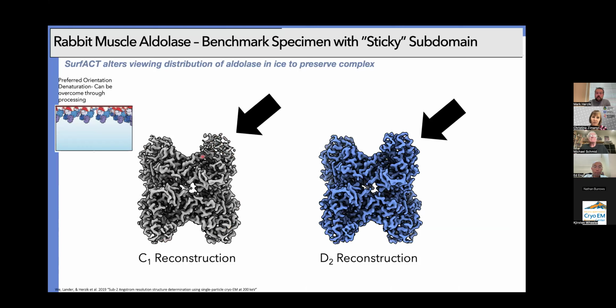But if you start completely asymmetric, with no symmetry imposed, they all group to one protomer. If you enforce symmetry too early, this will be averaged across everything, and you'll think everyone has a weakened protomer, when in fact it's just one that's being misaveraged. And so not enforcing symmetry too early is a great way to figure out if and how much of your sample is destabilized.